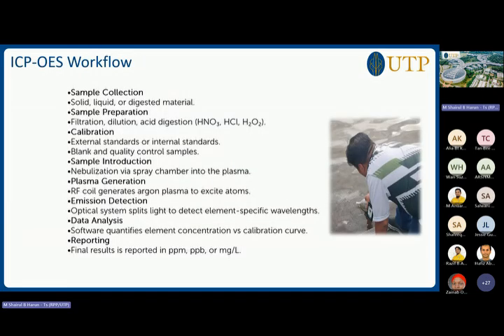The ICP workflow is more on the technical part. Mr. Azizam will later explain that in detail. The first step is sample collection, whether it is solid, liquid or digested material. The second step is sample preparation, including filtration, dilution, and acid digestion. Then we need to do the calibration, with external standards or internal standards, using blank and quality control samples.